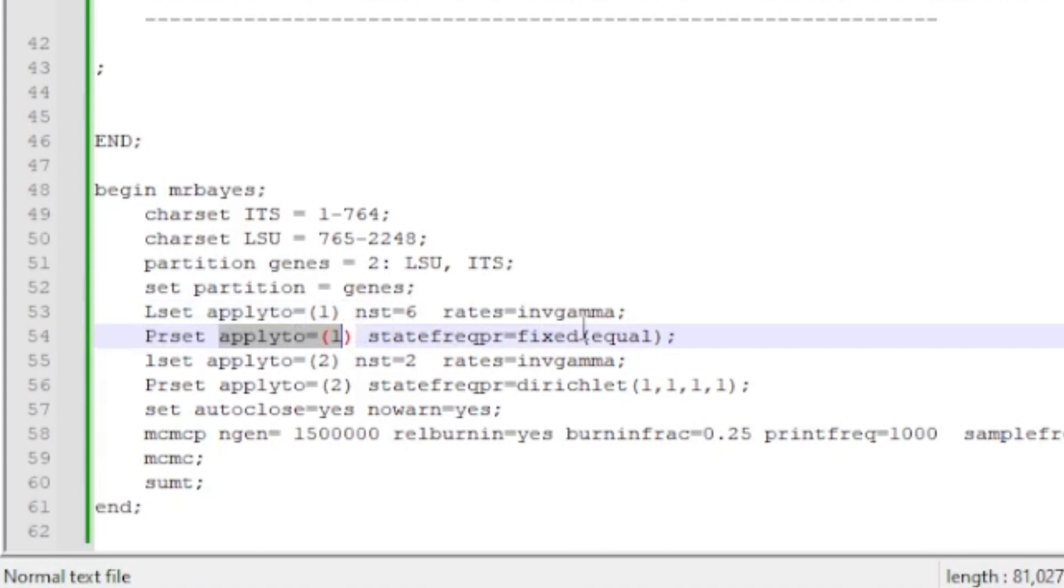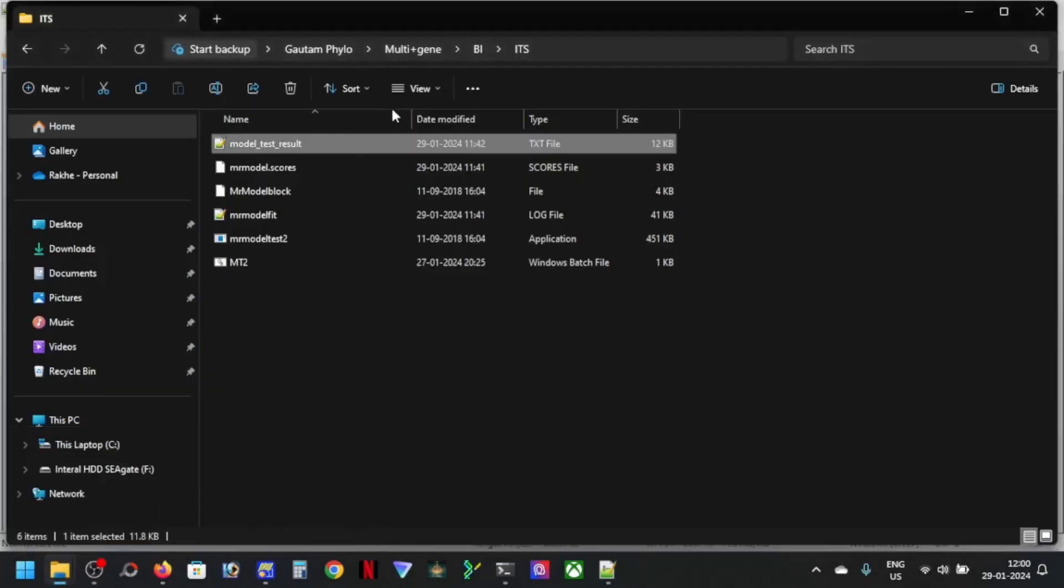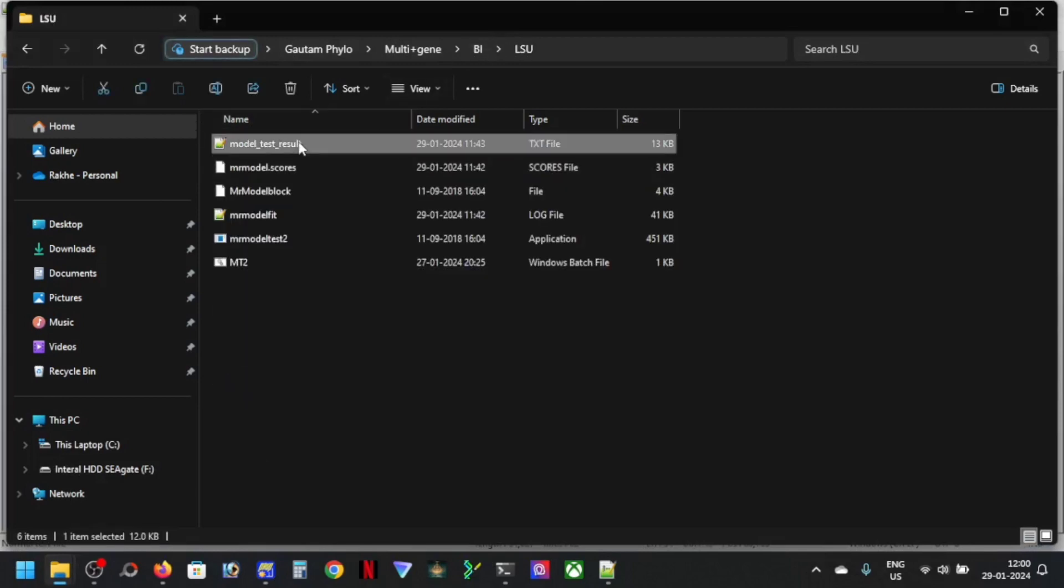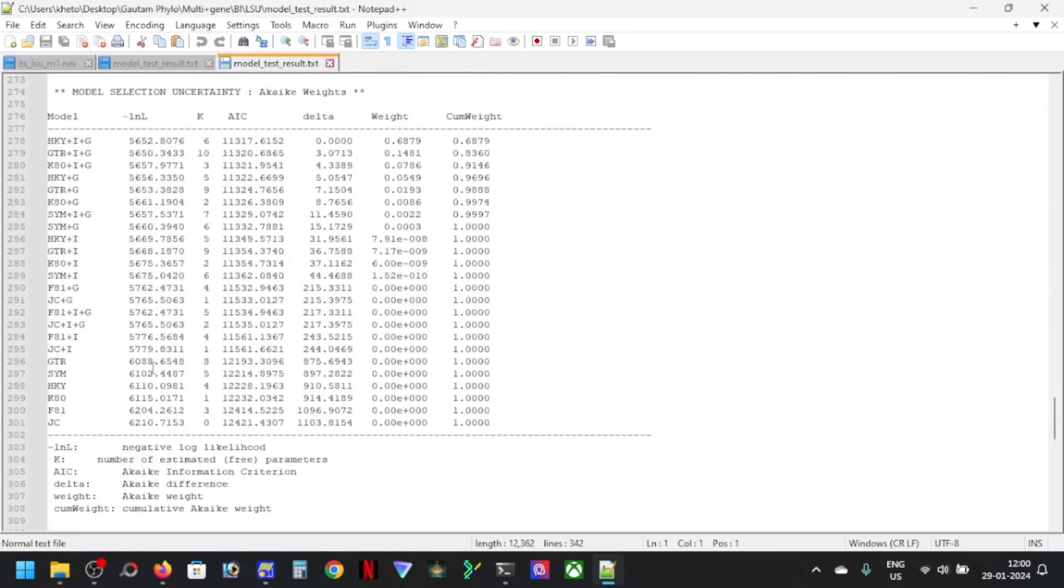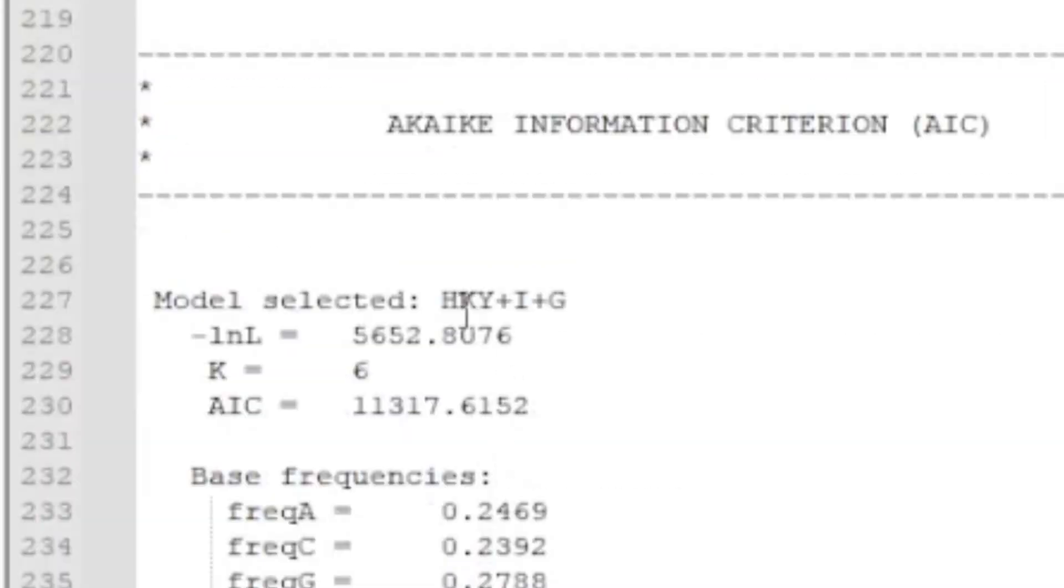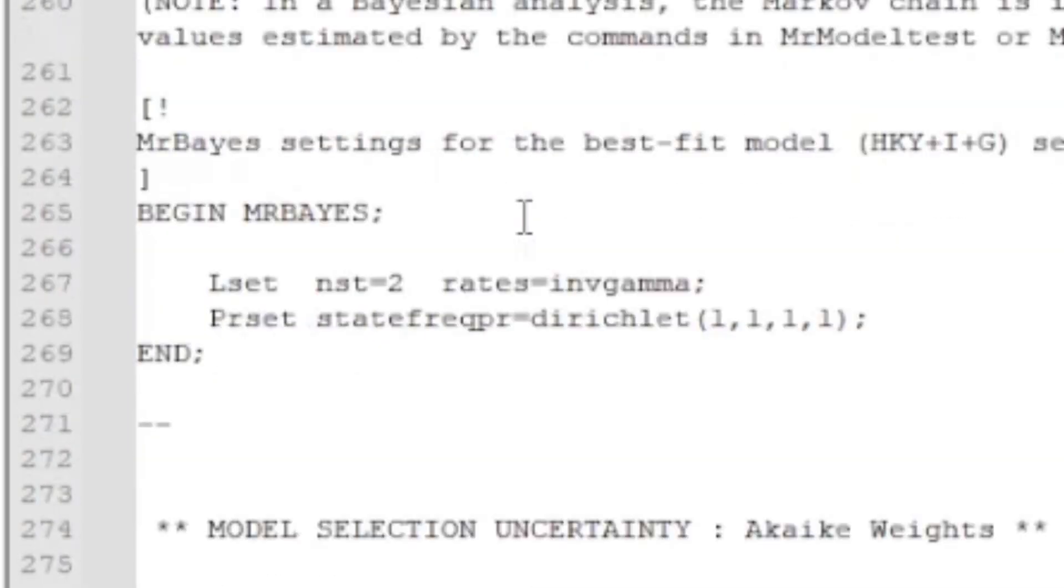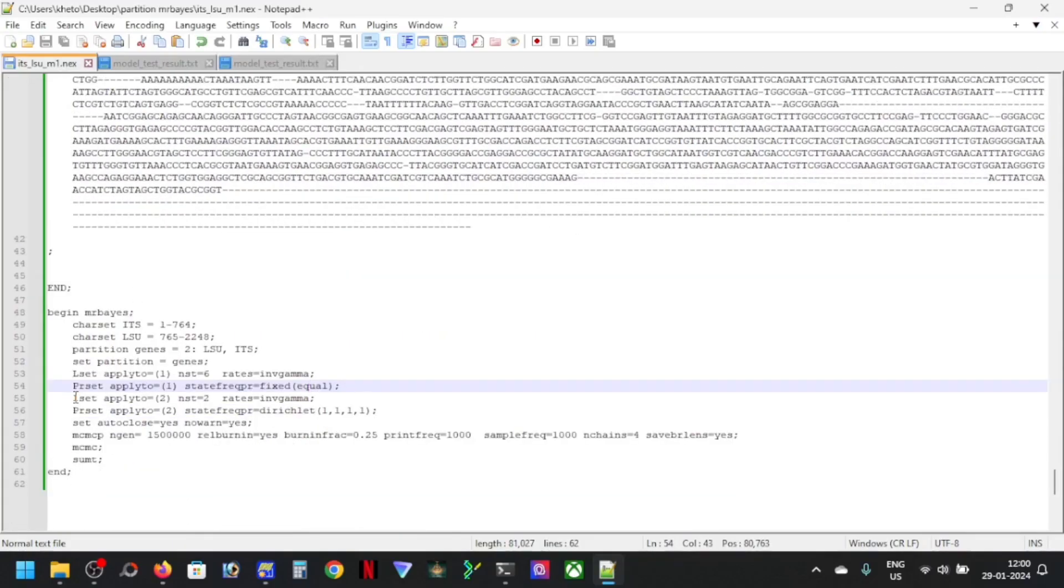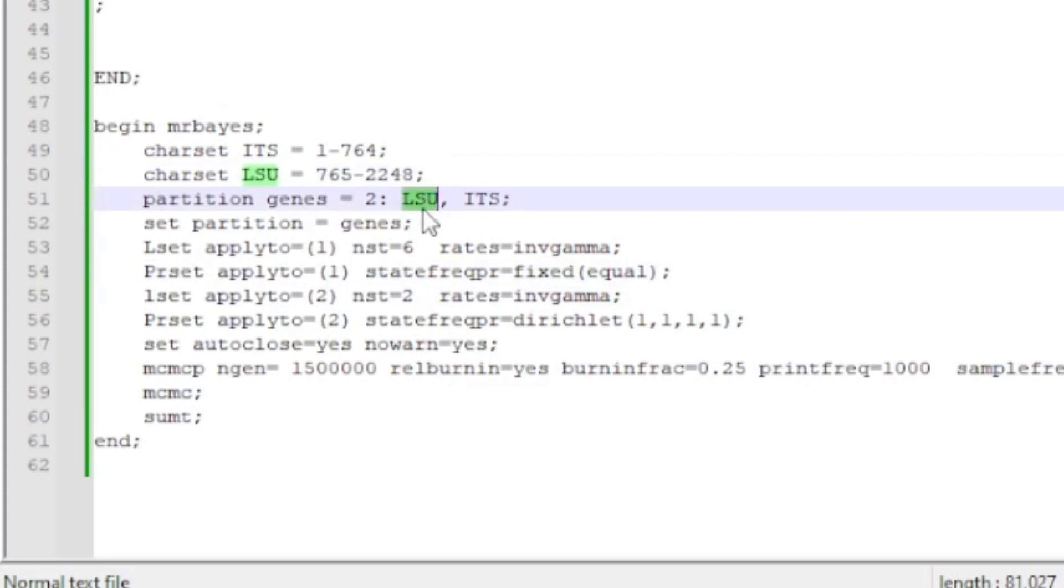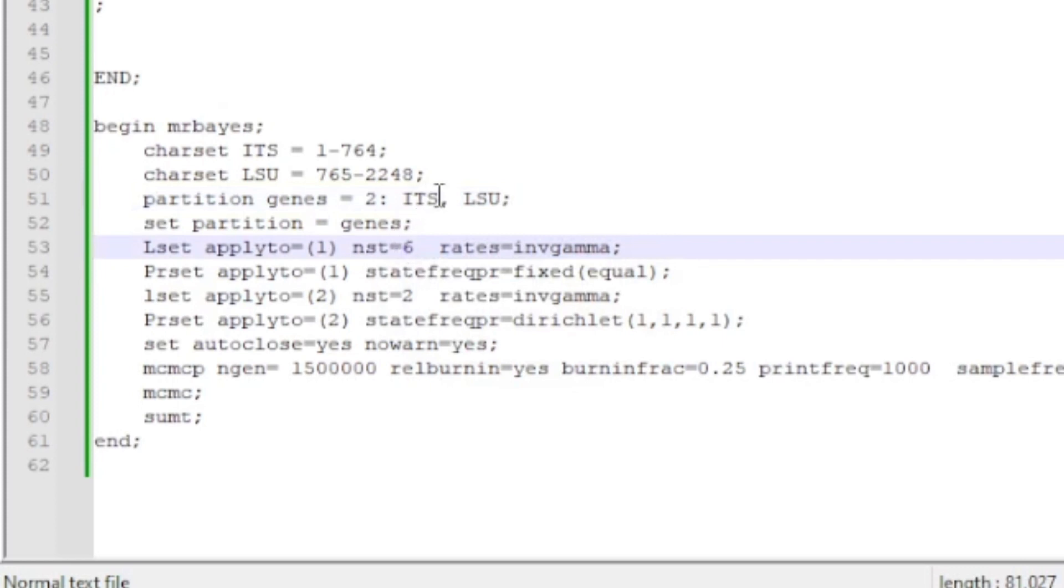In the same case you can see that for my LSU we have other model, this is HKY+I+G and this is the command line here. So same in this case we can do by L set apply to two because this time we're applying to the second partition. This is your LSU so this is right now, you cannot put the LSU first because that will make the program think that this is your first partition.